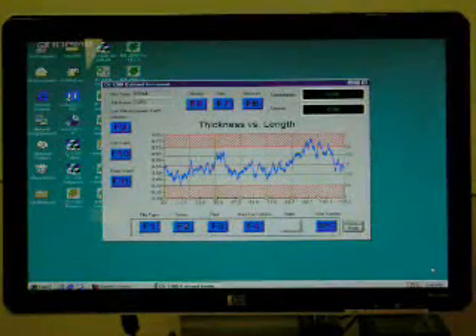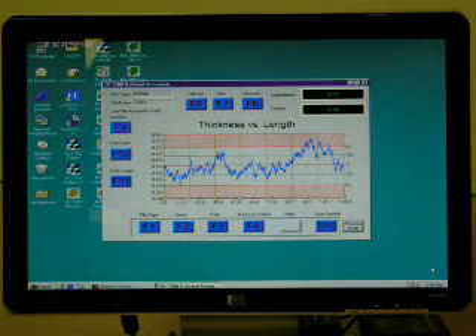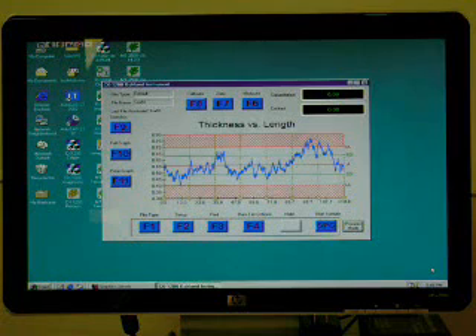Oakland Instrument manufactures several thickness tester models that meet the various testing methods specified by ASTM standards. The MX-1100 is a discrete point tester for point-to-point testing with an RS-232 port to allow data collection by leading third-party statistical software packages. The MX-1200 includes onboard statistics which can be displayed on the unit console and can also operate with our Oakland quality control software.